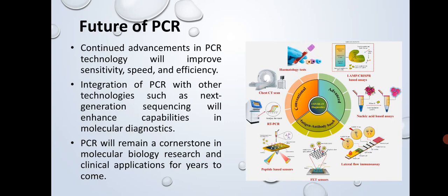Future of PCR. Advancements in PCR technology will improve its sensitivity, speed, and efficiency. Then integration of PCR with other technologies like next generation sequencing will further enhance its capabilities in molecular diagnostics. In the coming years, PCR is expected to remain a cornerstone in molecular biology research and clinical applications.